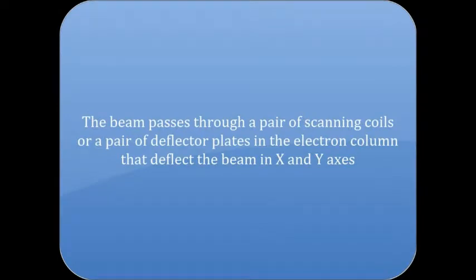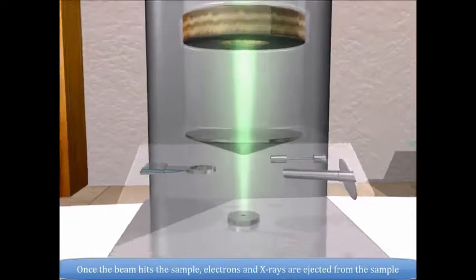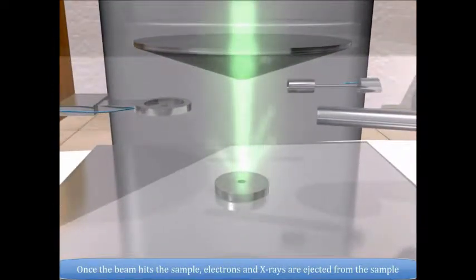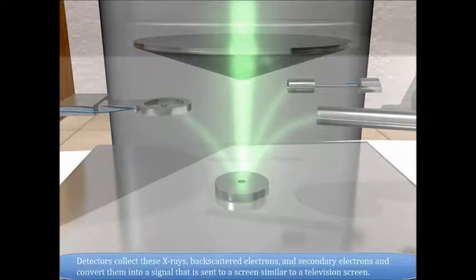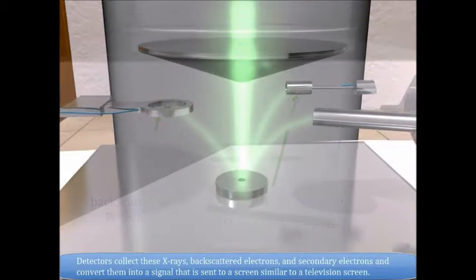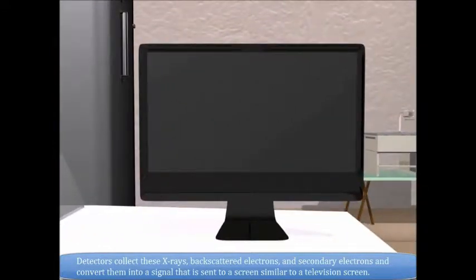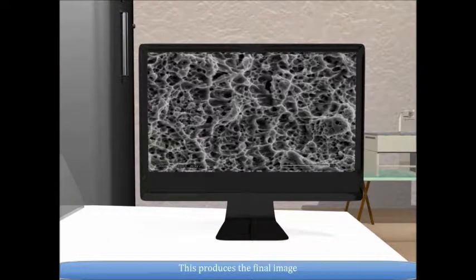The beam passes through a pair of scanning coils or a pair of deflector plates in the electron column that deflect the beam in the X and Y axes. Once the beam hits the sample, electrons and X-rays are ejected from the sample. Detectors collect these X-rays, backscattered electrons, and secondary electrons and convert them into a signal that is sent to a screen similar to a television screen. This produces the final image.